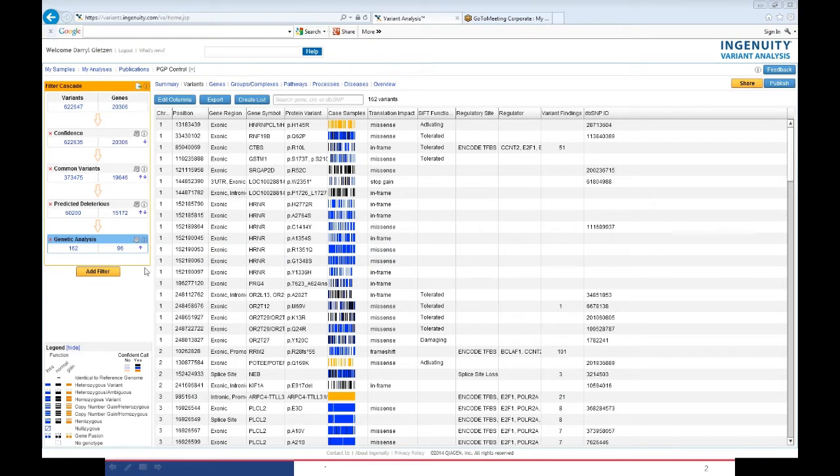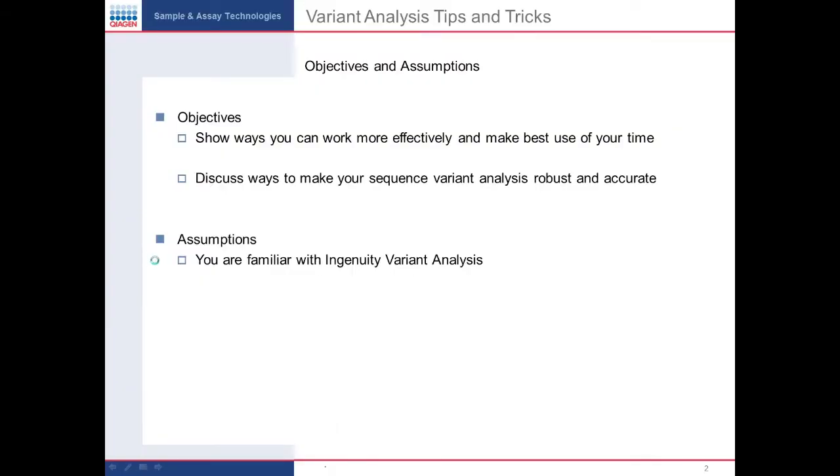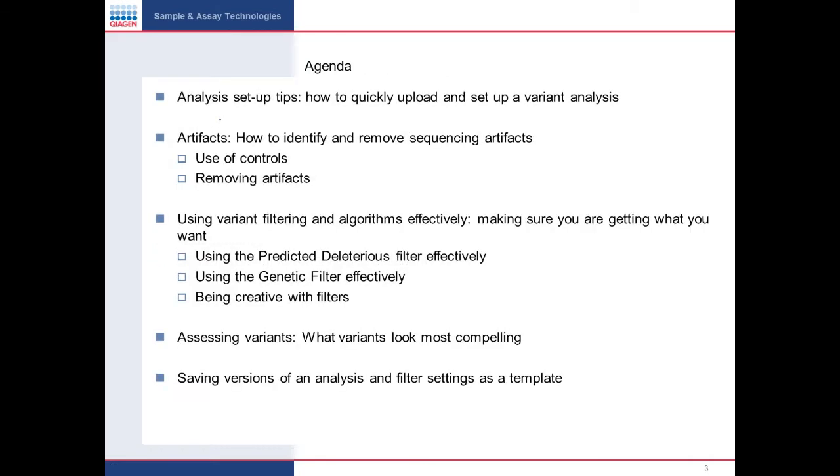So the first thing we're going to do today is walk through the agenda. We're going to talk primarily about how to get started more effectively. So analysis setup tips, and how to quickly upload and analyze your variant analysis.